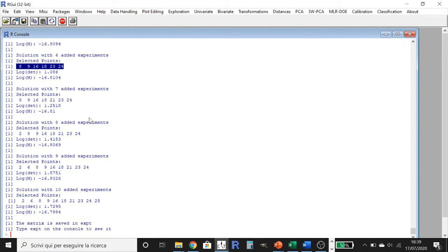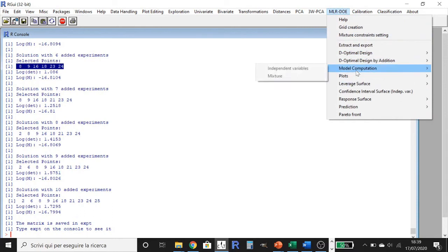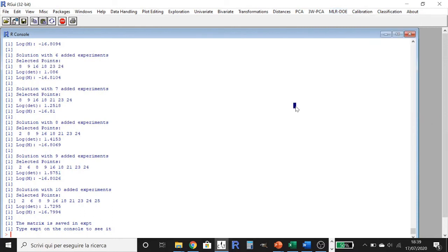In our case, we will go to MLR DOEM, Model Computation, independent variables, and so on, as already explained in other tutorials. Once the model is obtained, we need to validate it.